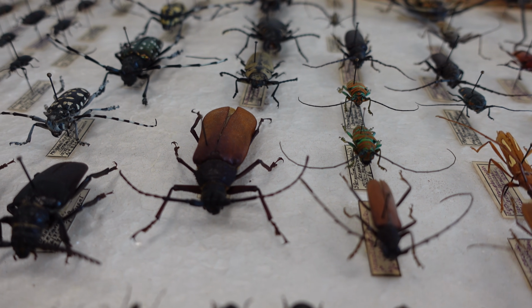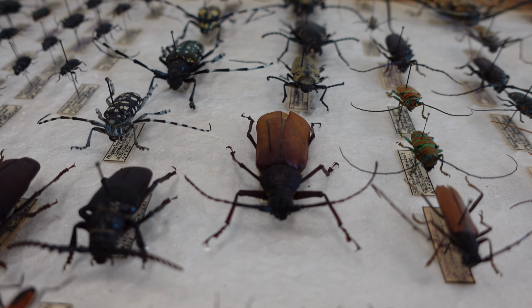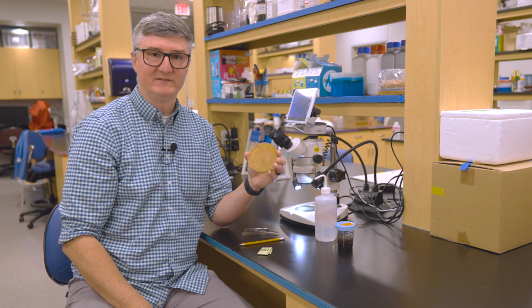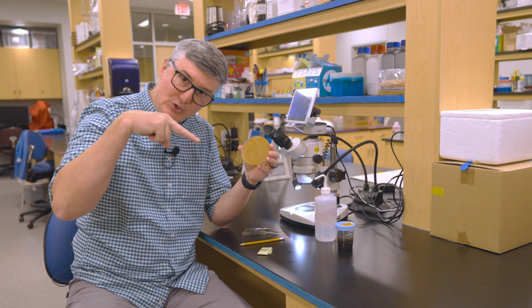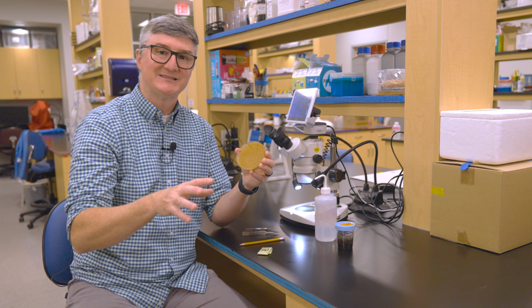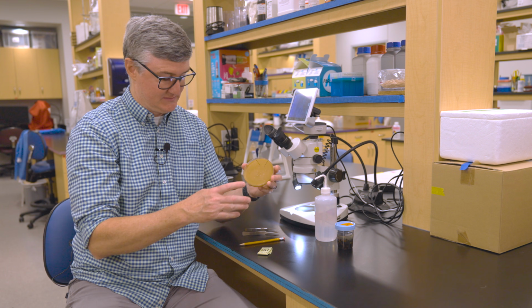If you've hung out or known any entomologists, we have insect pins that we use to preserve insects for insect collections. You can get pins of different thicknesses. I like to have a pretty average size, a standard size insect pin. You see 2 of them stuck into the wax here. The purpose of these insect pins is to secure the bee so that while you're dissecting it under the microscope, it's not moving or shifting so that you can control what it is you're actually trying to do.